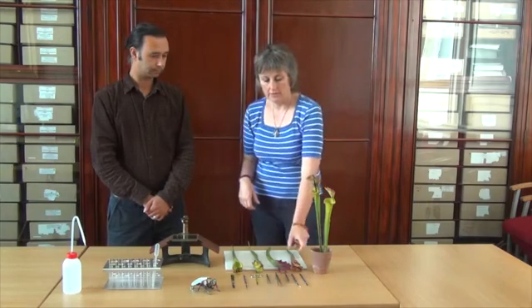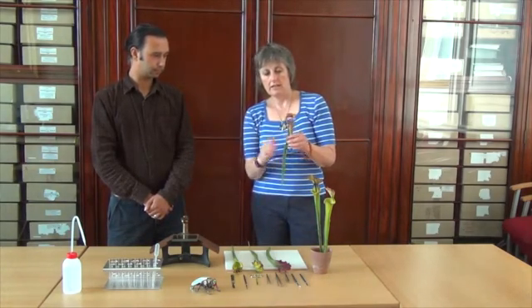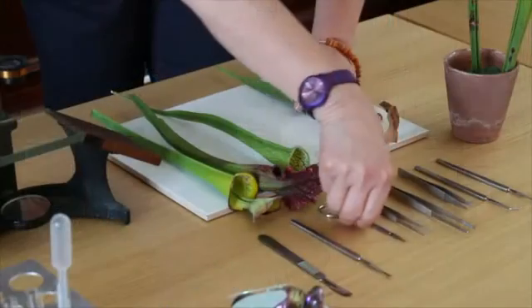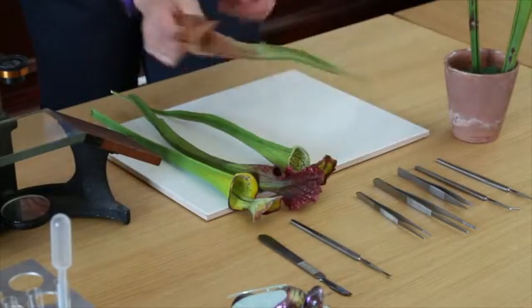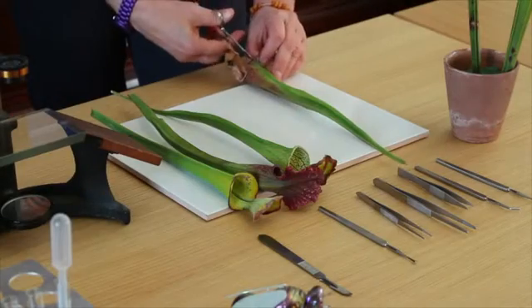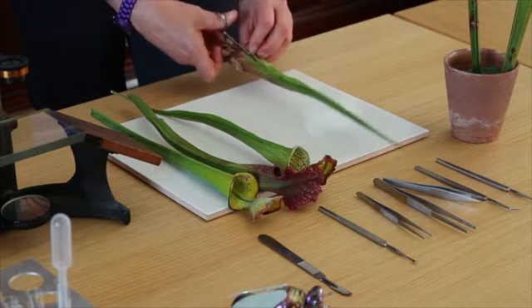Today we're going to focus on the Sarracenia, and the next stage is a dissection. It's better to use the scissors for the main dissection down here. I'm now cutting through the first zone — the very slippery zone.